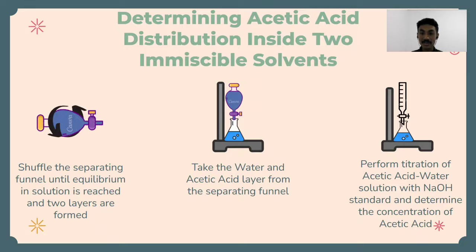Also, when shaking, do not forget to open the separating funnel valve regularly, because the mixture has a volatile property, so the vapor needs to be released into the environment. This is also done so as not to damage the separating funnel that is being used.